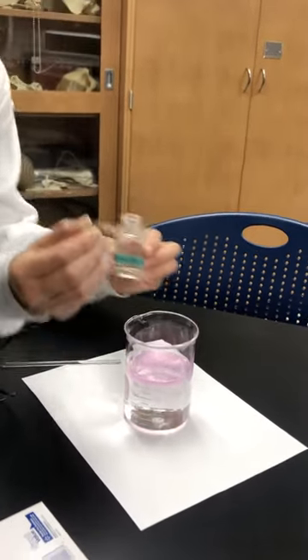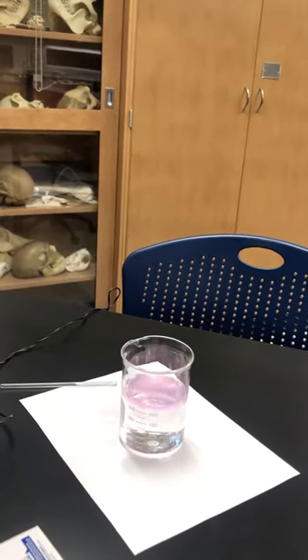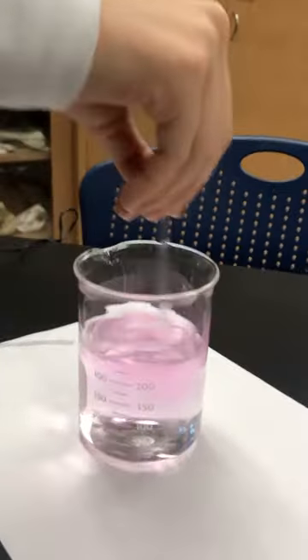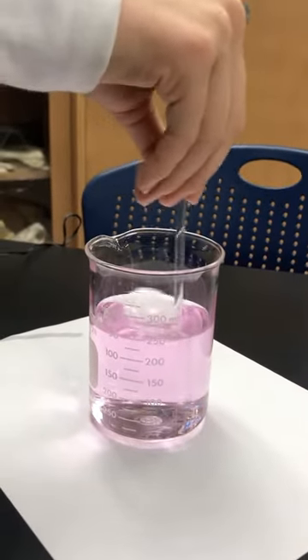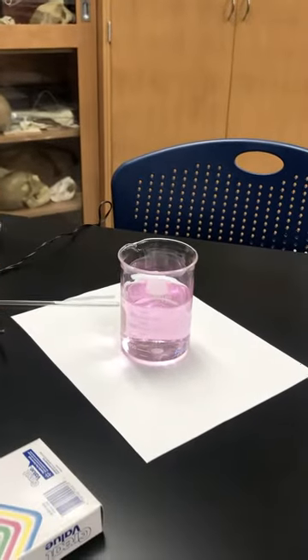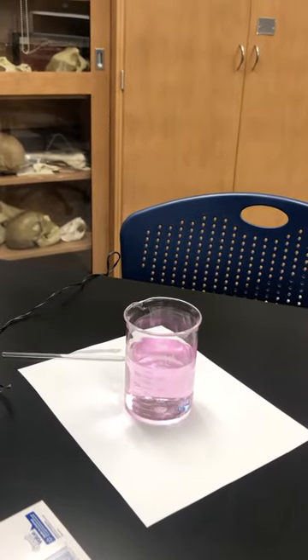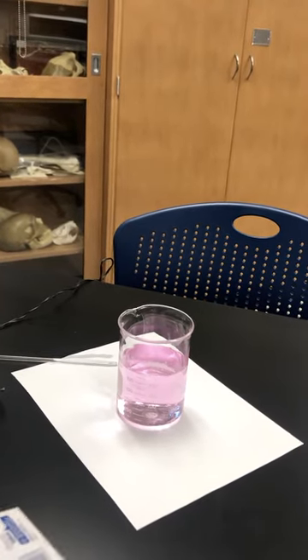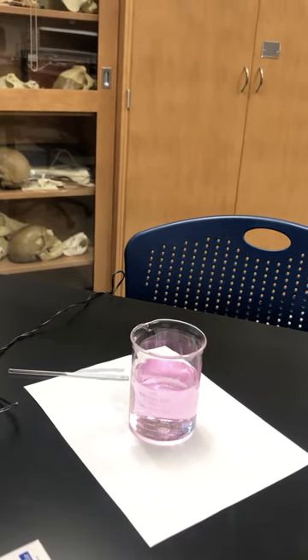But once she gets those 20 drops added, we're going to have her stir again with the stirring rod. And she's just going to stir that phenolphthalein into that baking soda water solution. And again, you can see it turns that pink color. Now what we're going to have Allison do is, we have a basic solution. Remember, phenolphthalein is just a color indicator, so its only job here is to give us visualization, to allow us to see the chemical reaction happening. So in a basic solution, phenolphthalein turns bright pink.